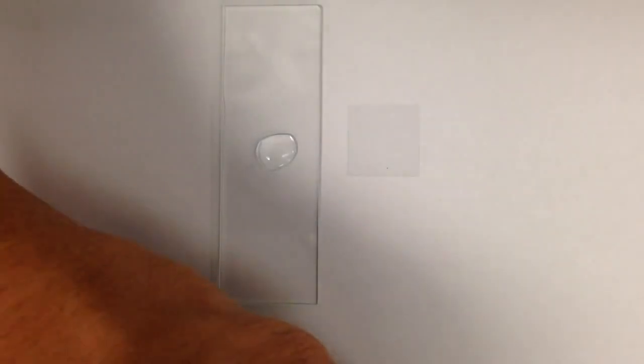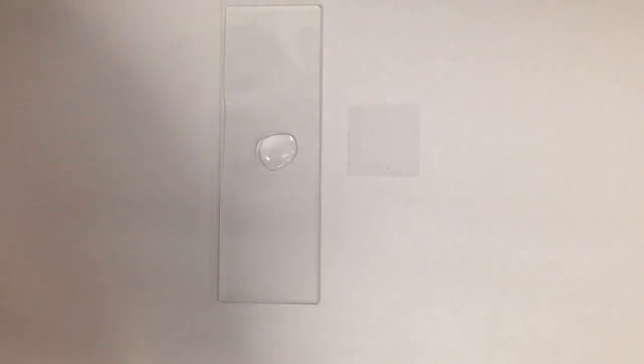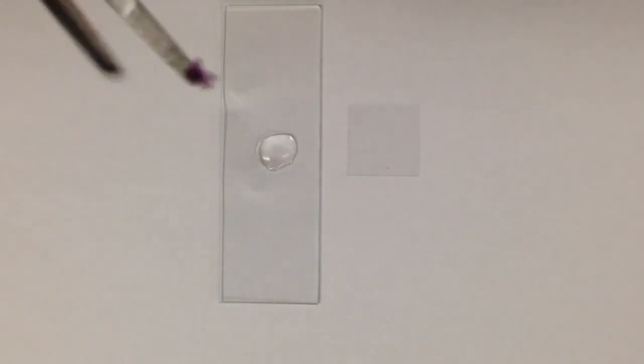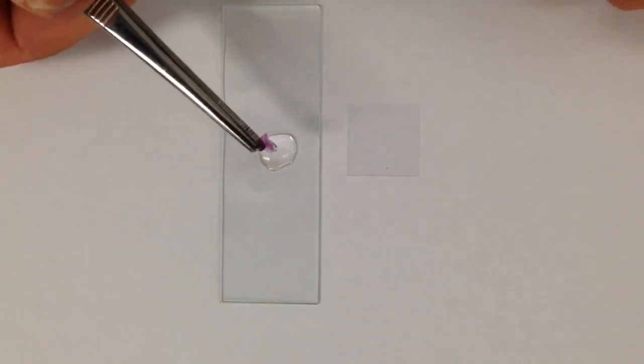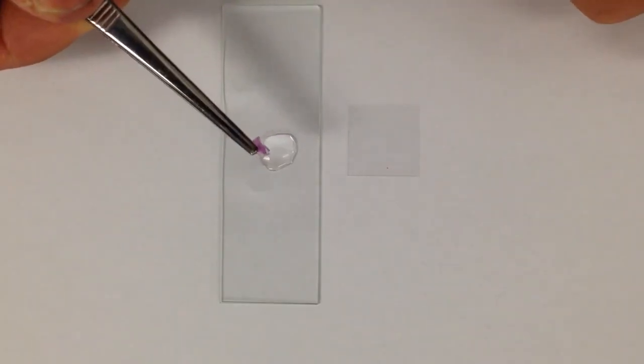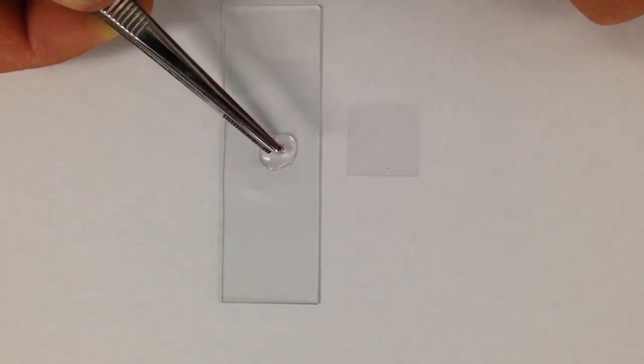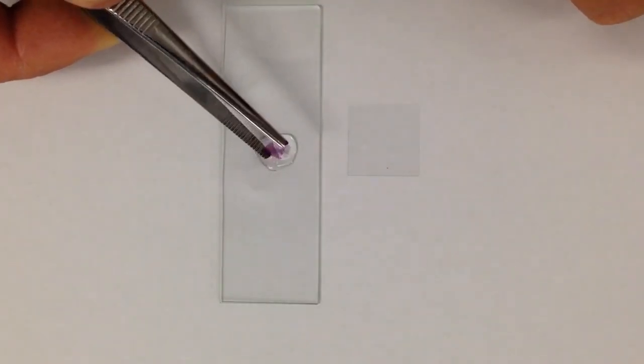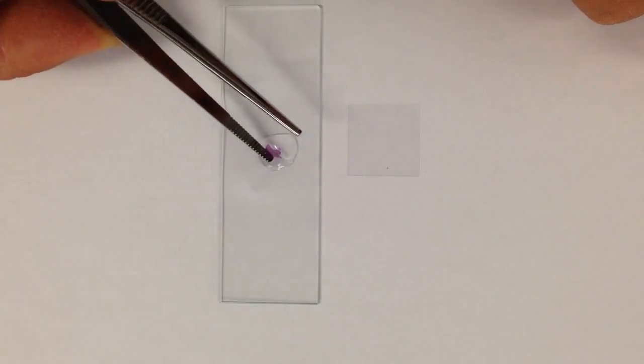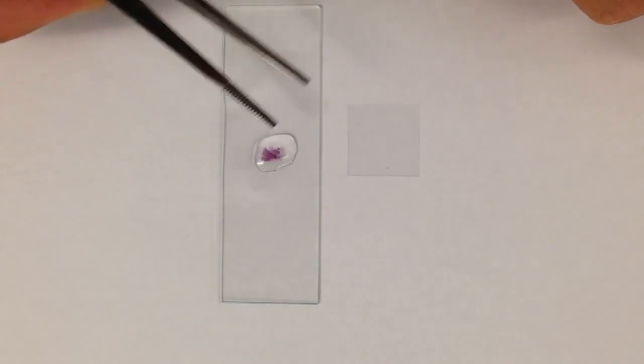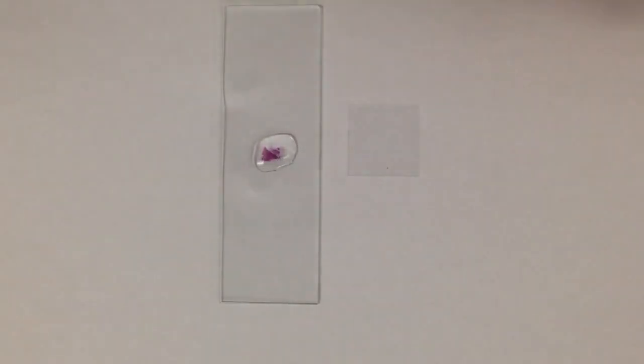So once you get that, if you want to use a pair of forceps, tweezers rather, what you can do is grab your onion skin and then slowly and carefully place it in the water droplet on your glass slide.